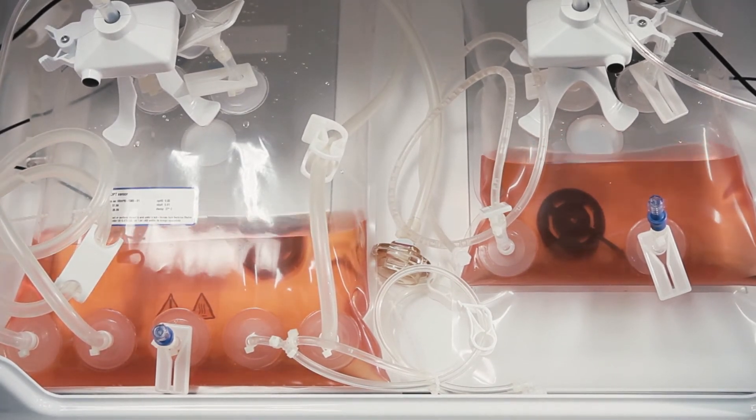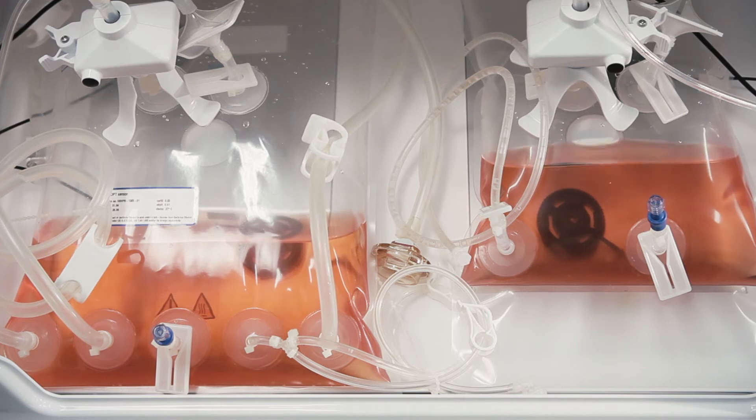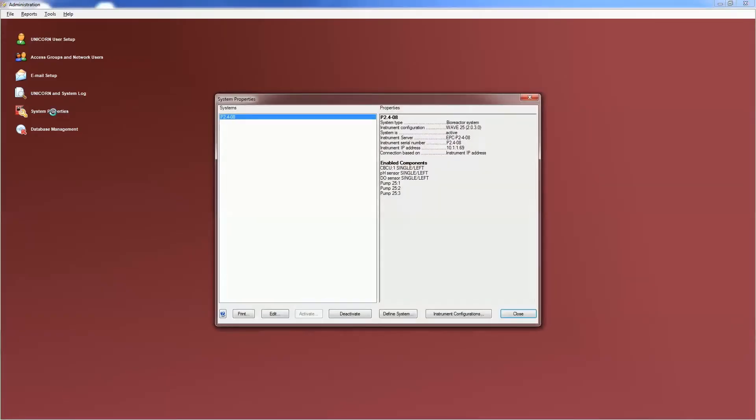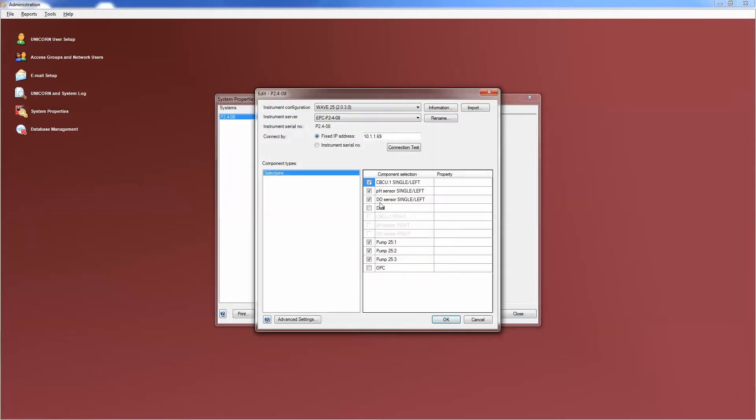To configure the system for dual mode, open the Administration module in the Tools menu, select your system and check Dual.